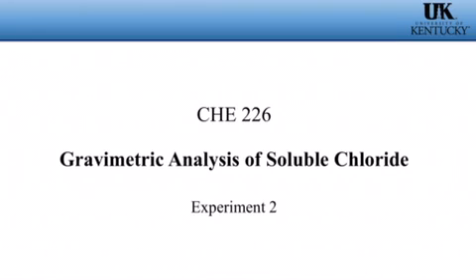This lab is about gravimetric analysis of soluble chloride. In this experiment, you are given an unknown sample. By doing gravimetric analysis, you should be able to determine the percent chloride in your unknown sample.